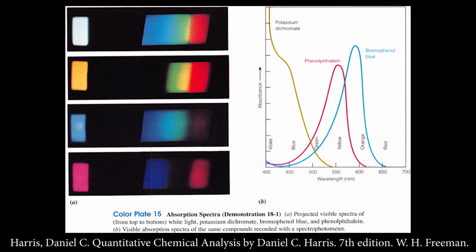And if we look at the absorbance spectrum, this is verified. They've drawn it in yellow because it appears yellow, but look, it's absorbing the violet and the blue. It's absorbing very well below 400 nanometers. It's absorbing pretty well at 450 and decently at 500. So it's absorbing the violet and the blue light, and the yellow is the appearance of what is left over.